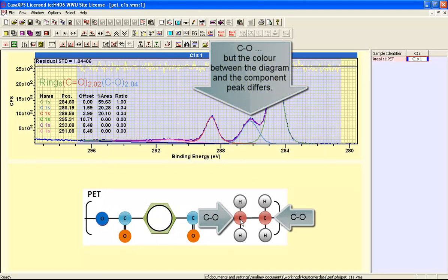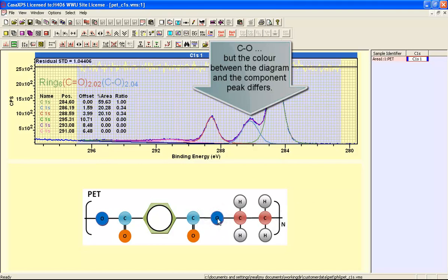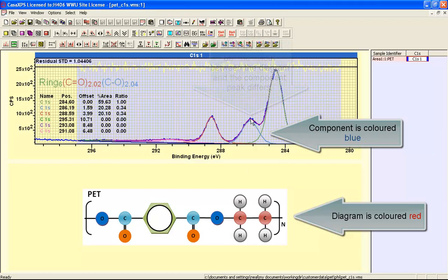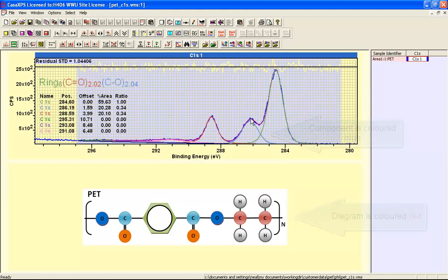For example here we have a carbon atom that is bonded with oxygen here and bonded with oxygen here. These are single bonds so we'd expect these single bonds to appear at this position in the peak model. Whereas when we have a double bond between the carbon and the oxygen then we would expect to see a chemical shift that would position the peak here.